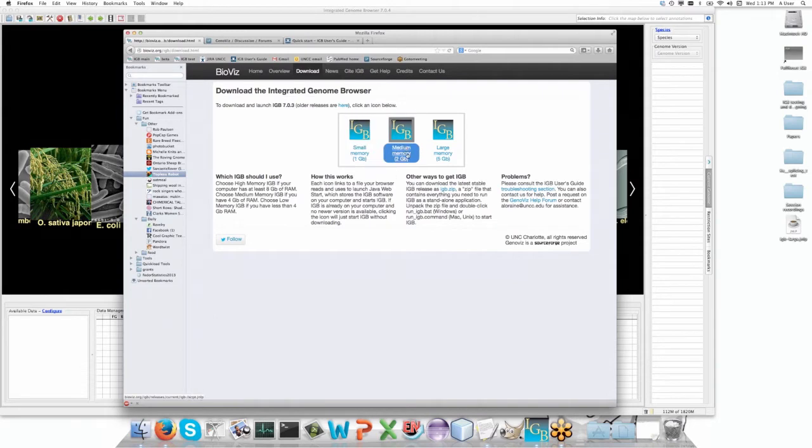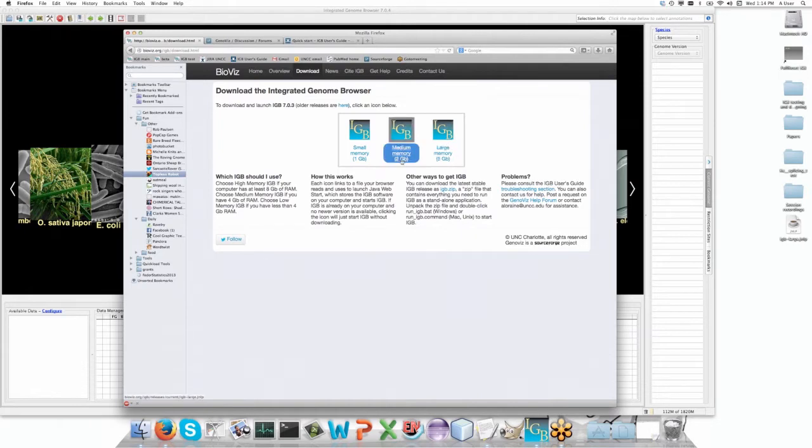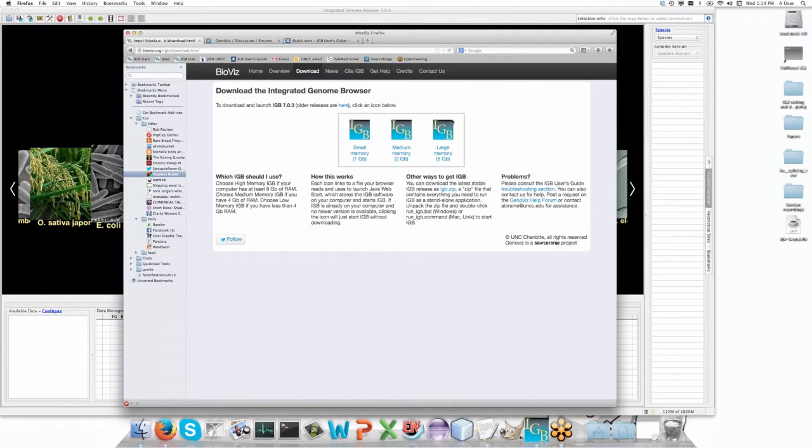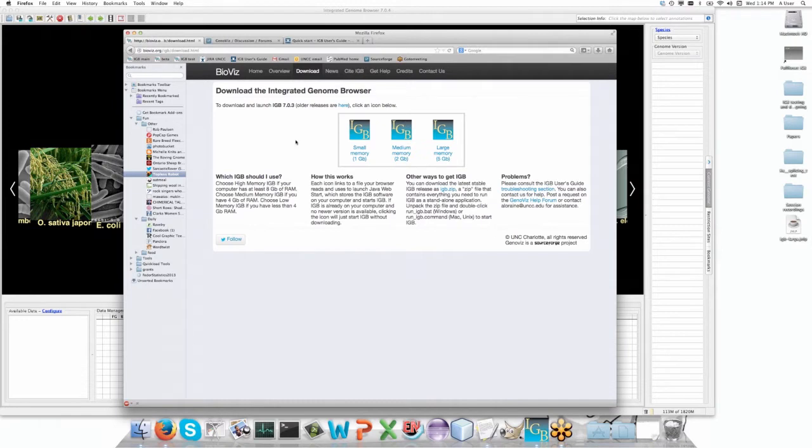The size of the memory is how much memory you're going to give IGBI to actually use while it's running on your computer. If you're running a Mac, generally you're very safe using either the two or five gigabytes. Unfortunately, the way Windows works is even if you have four gig of memory, a huge amount is being used by the operating system. So typically we recommend using the slightly smaller size if you're running on Windows.